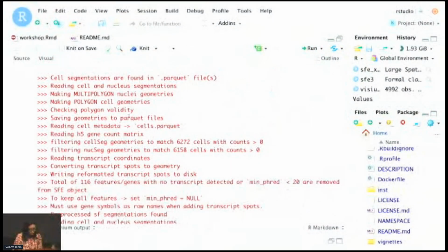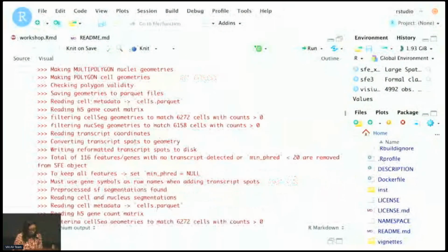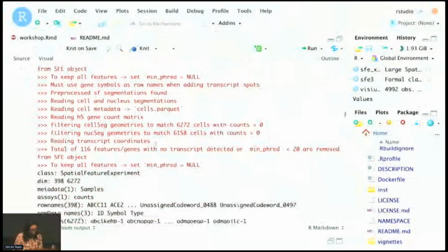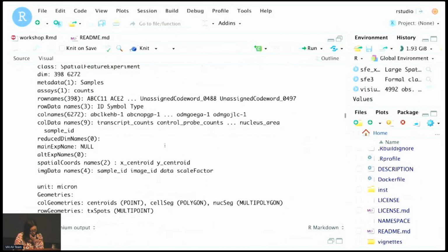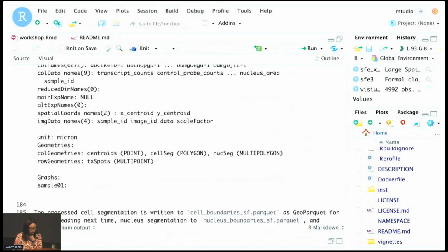Yeah, you see the messages about processing the coordinates into GeoParquet and writing that to disk. So here this is a data set. We have almost 400 features and over 6,000 cells. And we have a summary of the colGeometries and rowGeometries and so on.